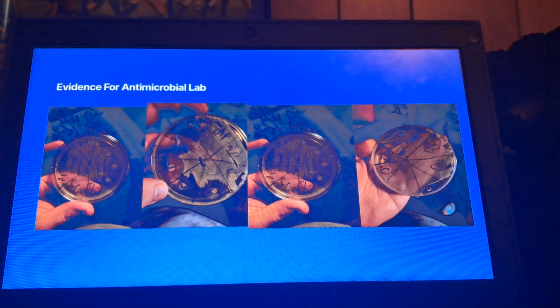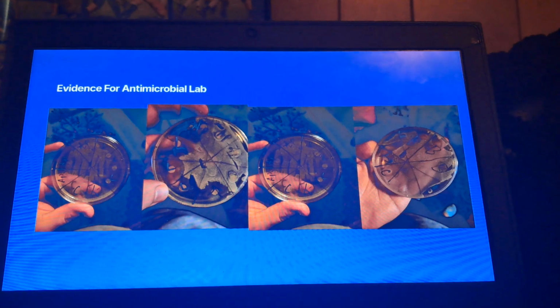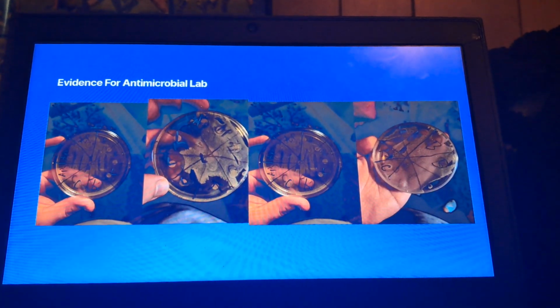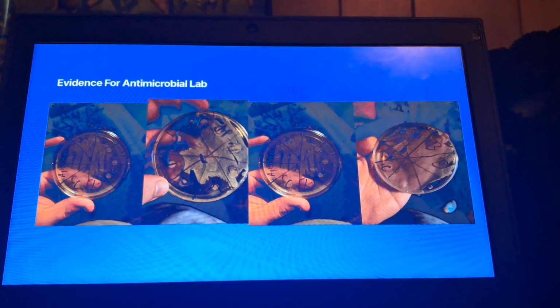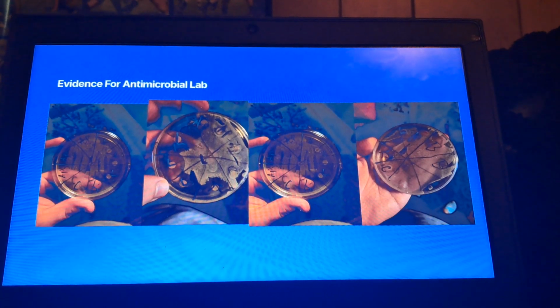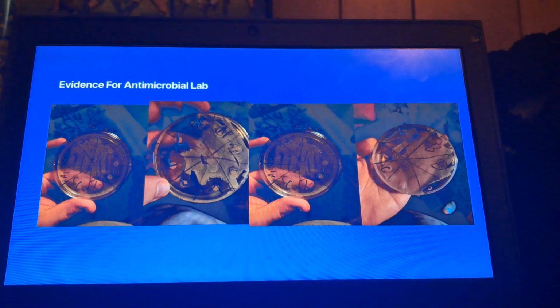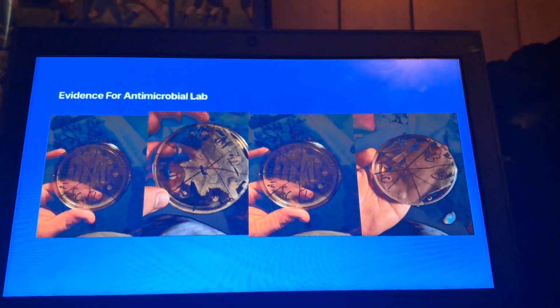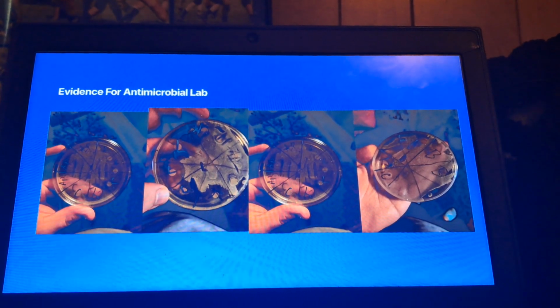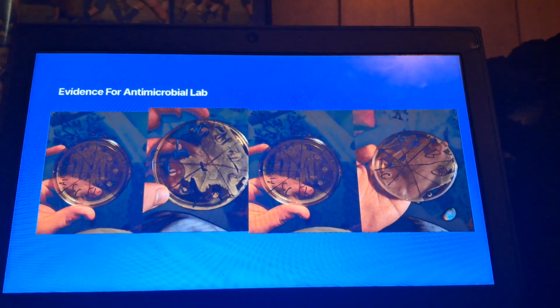And as you can see, for all the lemons that I tested marked with an L, that was the only contender that I tested that actually successfully was antimicrobial. The lemon juice that I got from the plate on there did not allow any bacteria to climb up its way over into and around it. So it's just like the kanamycin where it's basically completely fine. This was after like I believe like 19 hours of letting it sit. Some lemon juice leaked out from the sides of the paper disc, and that whole area was kind of just non-contaminated with bacteria.